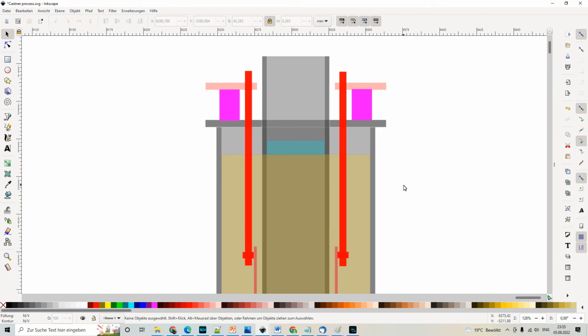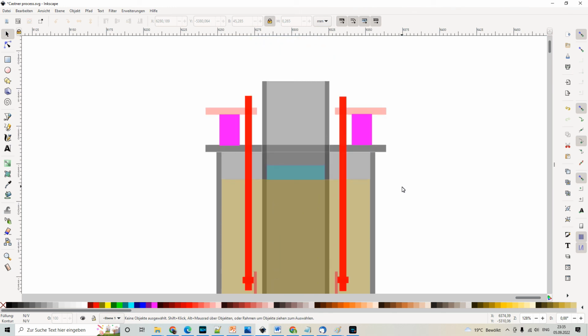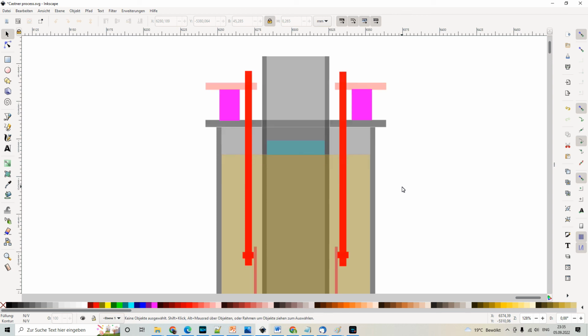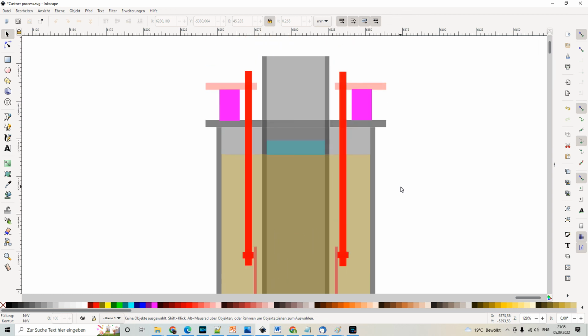Another change that I would do is to build everything a little bit bigger, because a small cell is always a little bit dangerous in terms of explosion. If you're having explosions, then a small cell is more likely to eject some sodium hydroxide somewhere. A bigger cell may contain the explosions a little bit better than a small cell.